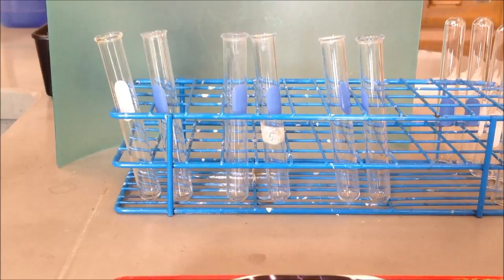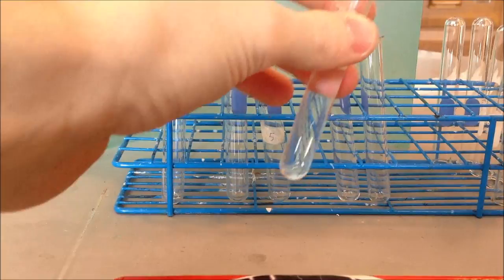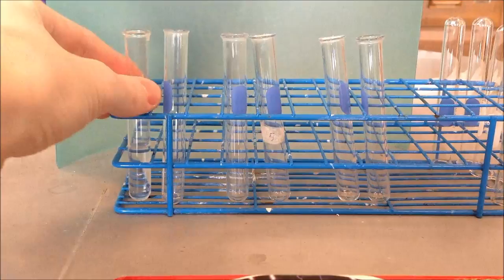Now we're ready to do the protein test. We will use these two test tubes for the protein test. In the first one, I'll put just water — a little bit of water in there. So that's water, and then in the second one, I'm going to put a protein in there called pepsin.